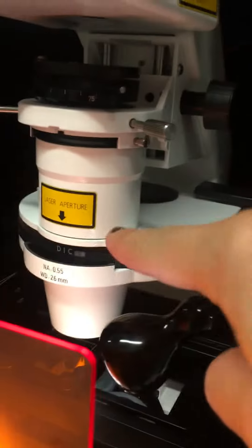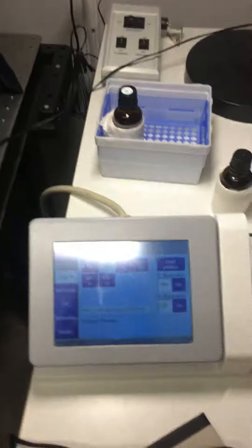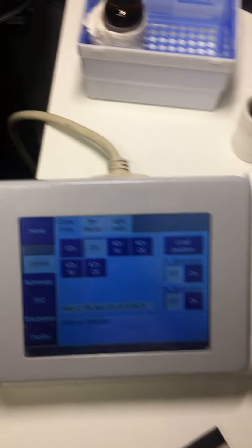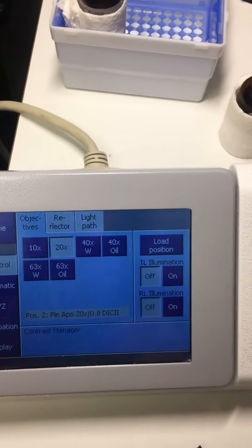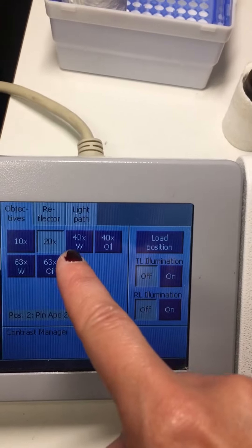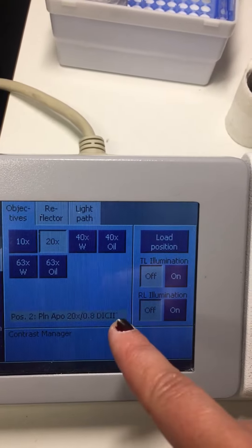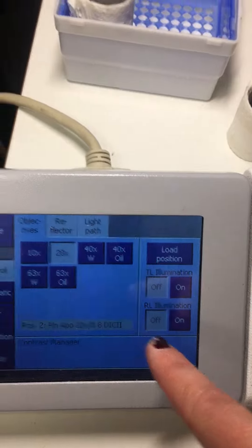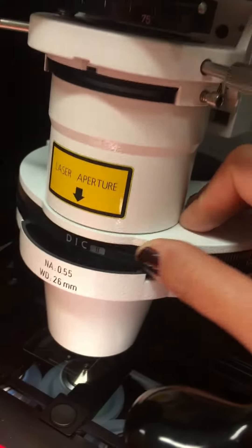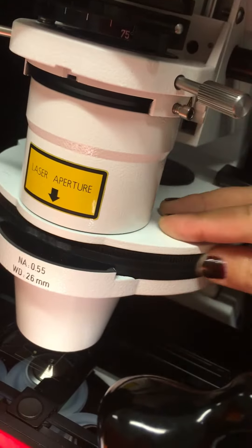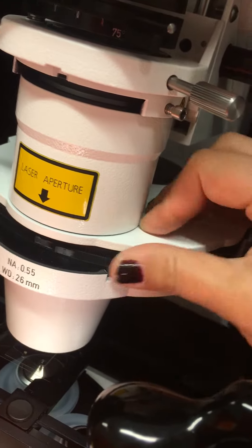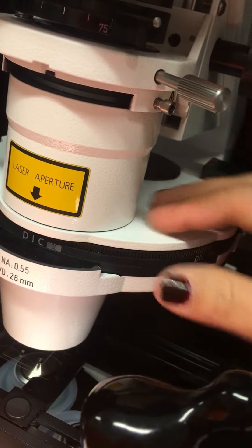To know which of the prisms should be positioned here, you can go to our TFT display for advice. You can see that for this particular lens it is advised to use DIC-2, so then I check and yeah, it's the right one in the work position and it should be here.